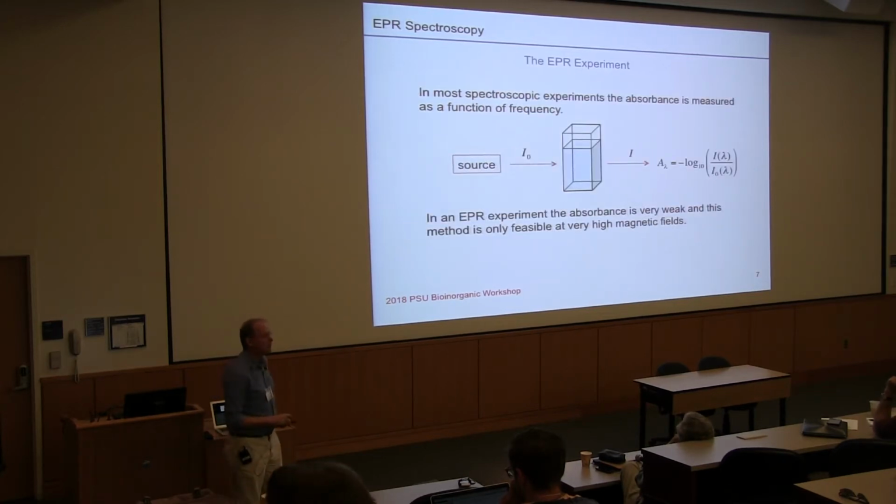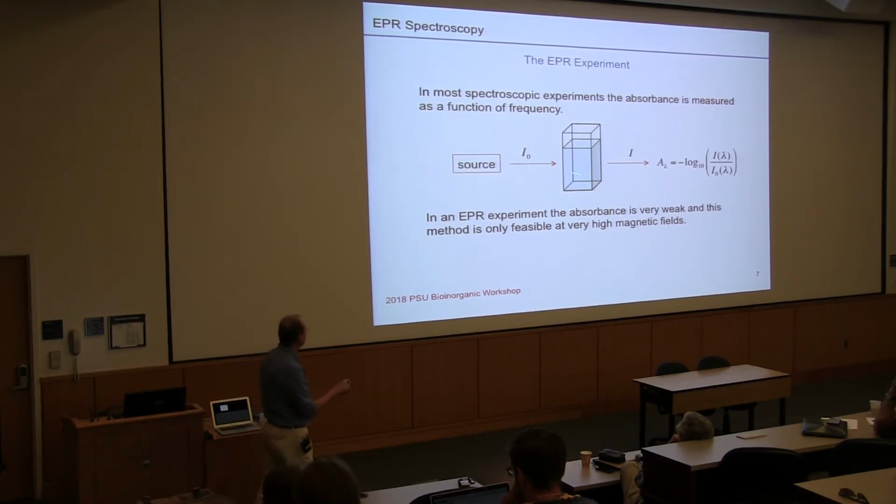That creates a whole bunch of challenges. Normally if we do an absorption experiment, we have our sample and we have a source. We shine our electromagnetic radiation through the sample and we try to measure how much of that has been absorbed, right?